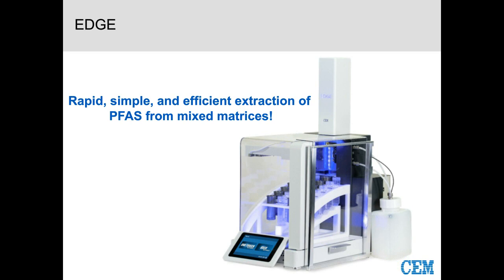So I'm going to bring this full circle. It was the title of the talk. I covered it in the conclusion, and now I'm going to say it again. Rapid, simple, and efficient extraction of PFAS from mixed matrices. If you take anything away from it, just the simple title is what I want you to remember, because that's what the truth is.